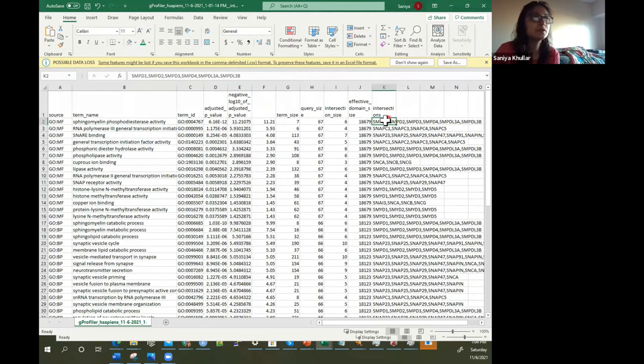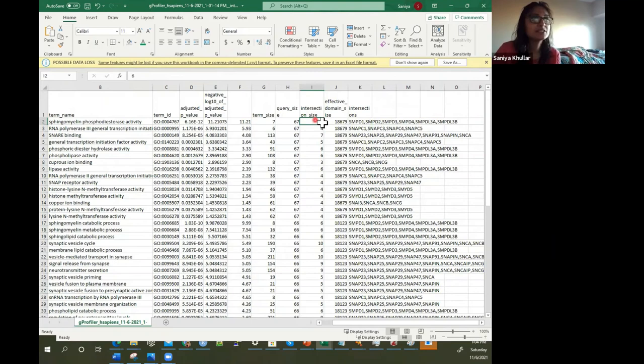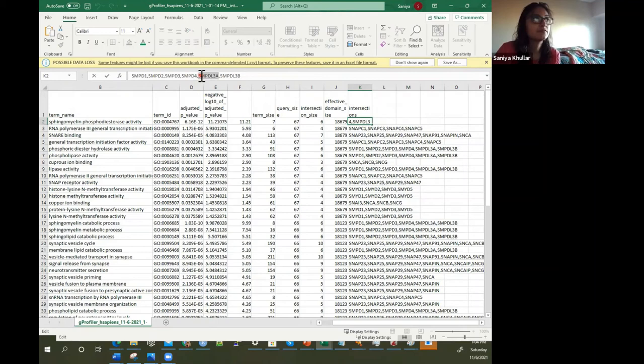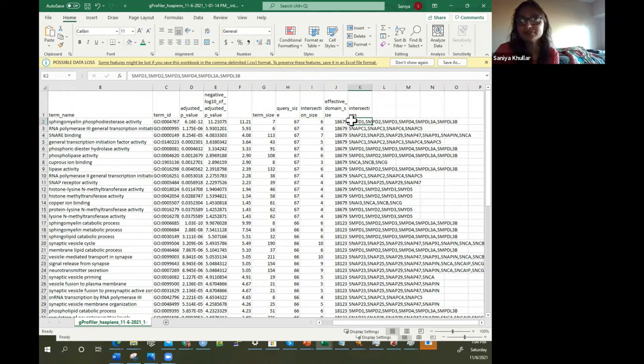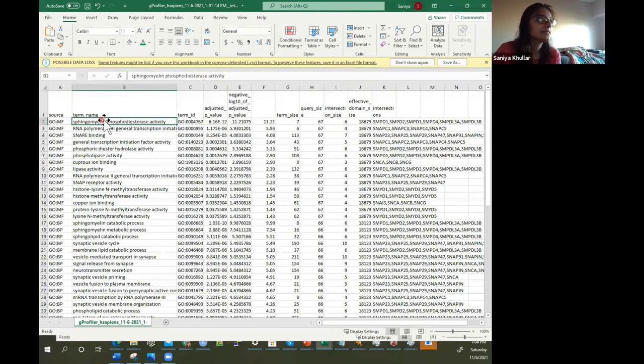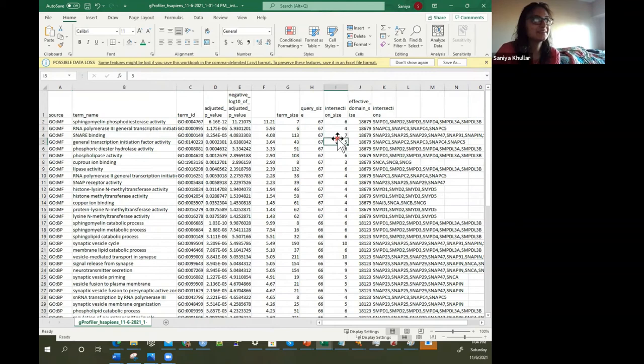Here you can also see a snapshot of which genes are involved and what the intersection size is. This intersection size is 1, 2, 3, 4, 5, and 6 — meaning six genes from our approximately 559 genes were found to be involved in sphingomyelin phosphodiesterase activity. And for another term — SNARE binding — seven were found. The term size typically refers to the number of genes that are in that annotated set.